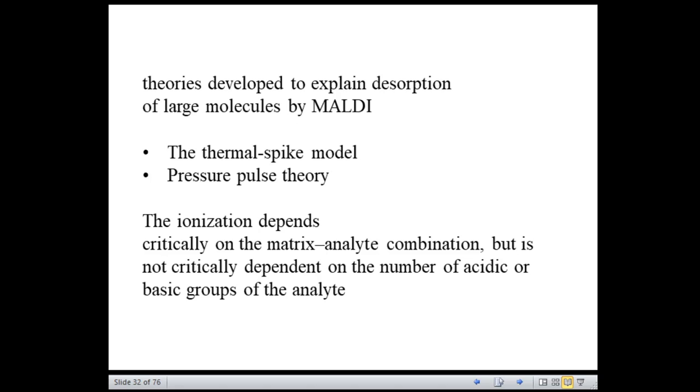As a result, a rapid rise in desorption efficiency is observed. Here, the ejection of intact molecules is attributed to poor vibrational coupling between the matrix and the analyte, which leads to a bottleneck in the energy transfer from the matrix to the internal vibrational modes of the analyte molecule.